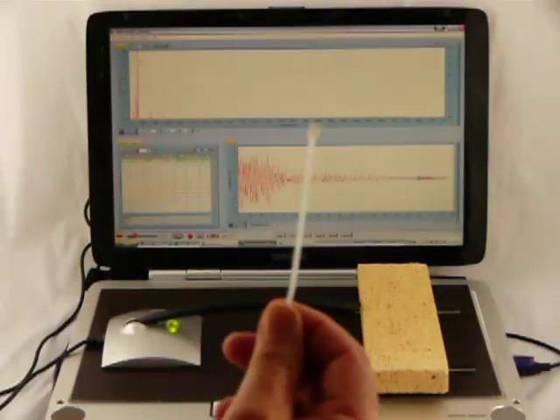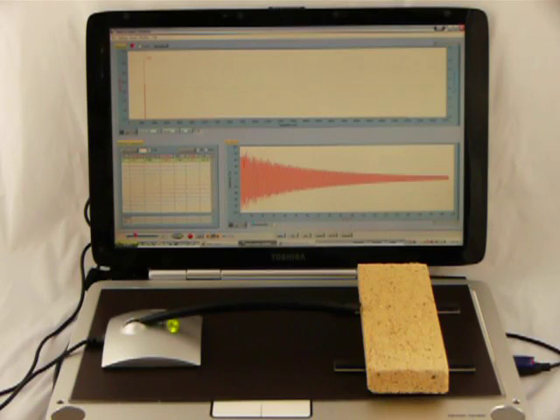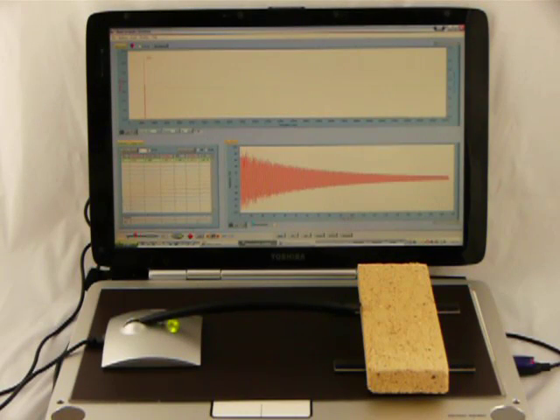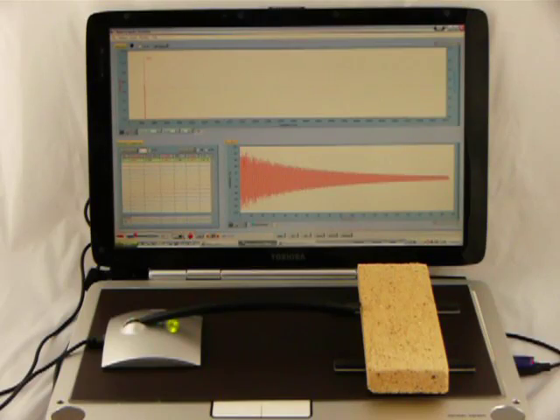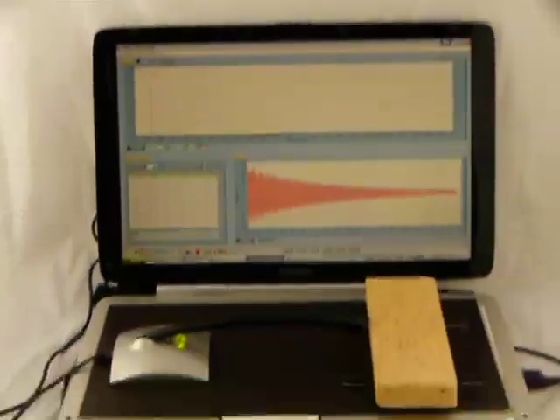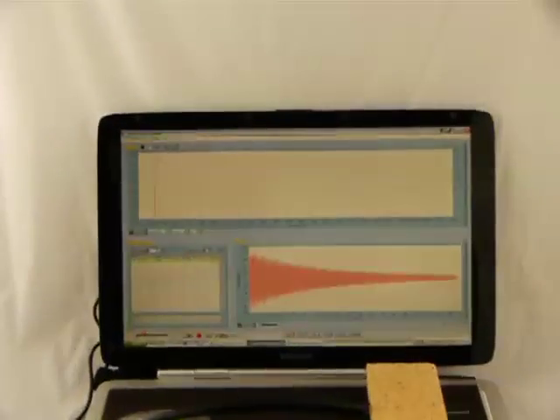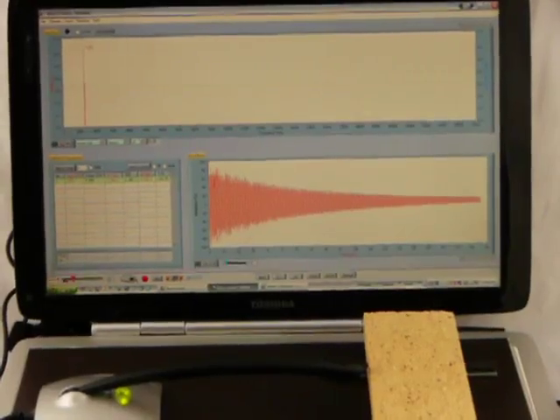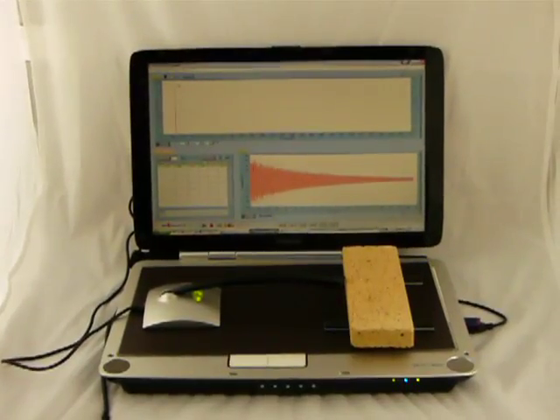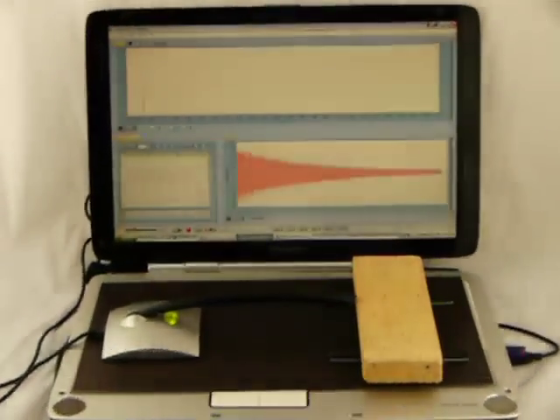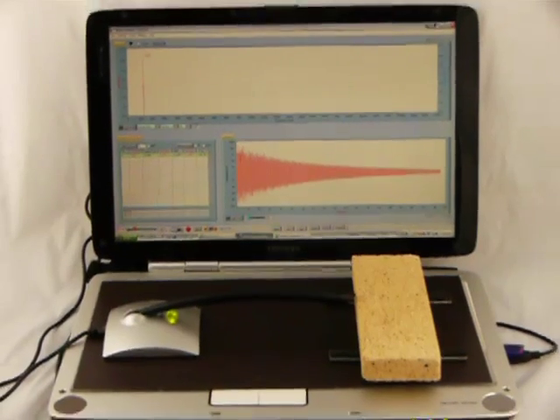Now we can do a test. Very simple. We tap it on one end with a small impulse tool. And we get 1281. As you can see, perhaps you can see the peak there, there's only one peak in this case. It's very simple. It also loads and shows it in the table. And that's all there is to it. So now you've taken a measurement with BuzzoSonic. We've got the resonant frequency, the out-of-plane flexural resonant frequency.